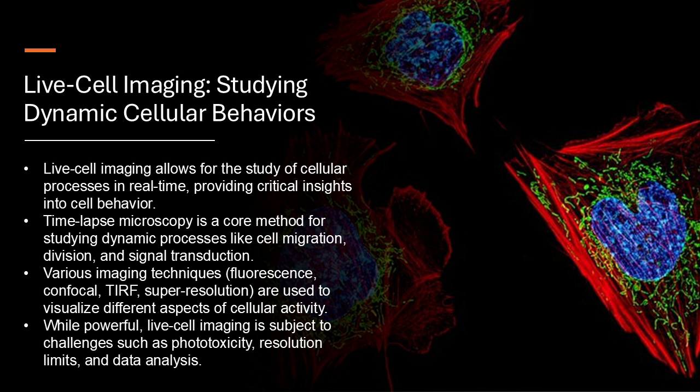Signal transduction. Remind me what that is again? It's essentially how cells communicate with each other and with their environment. They're constantly sending and receiving signals, telling each other to grow, divide, differentiate, or even die. So it's like the language of cells. Yes, exactly. And with live cell imaging, we can actually eavesdrop on these cellular conversations.